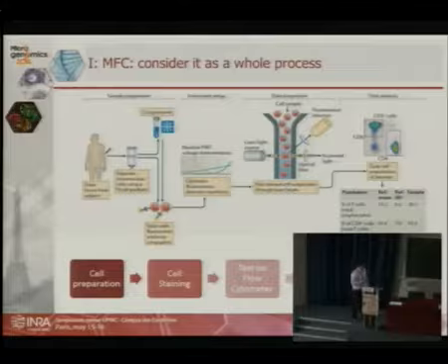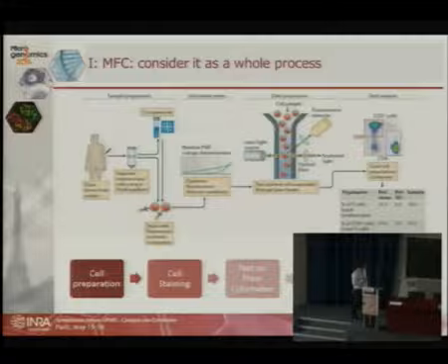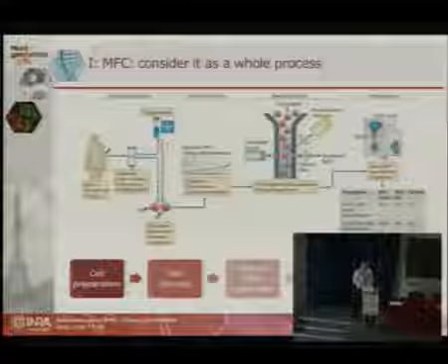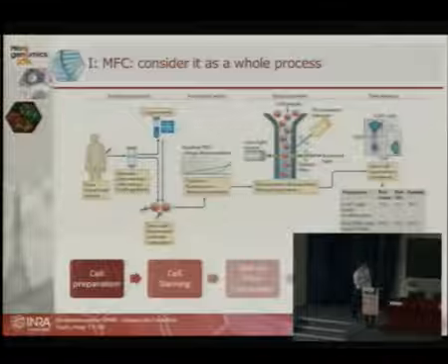And one of the things is that you have variability from instrument, and this we have quantified. It's around 3% of your measurements of flow cytometry. And what is here, this whole part, we believe it accounts for 30% of the variation. So really, this work on your protocols to extract cells.